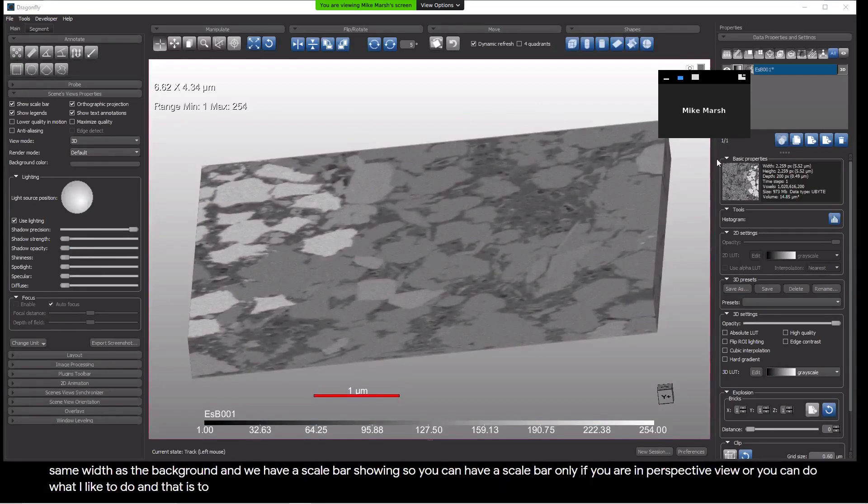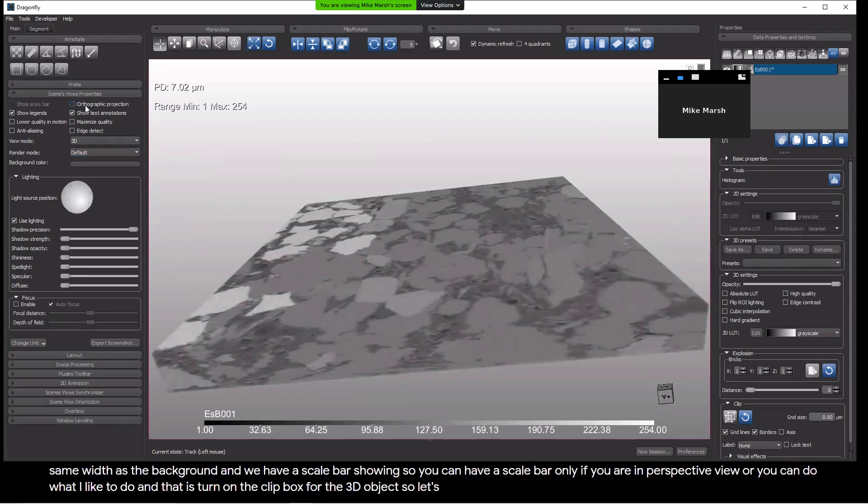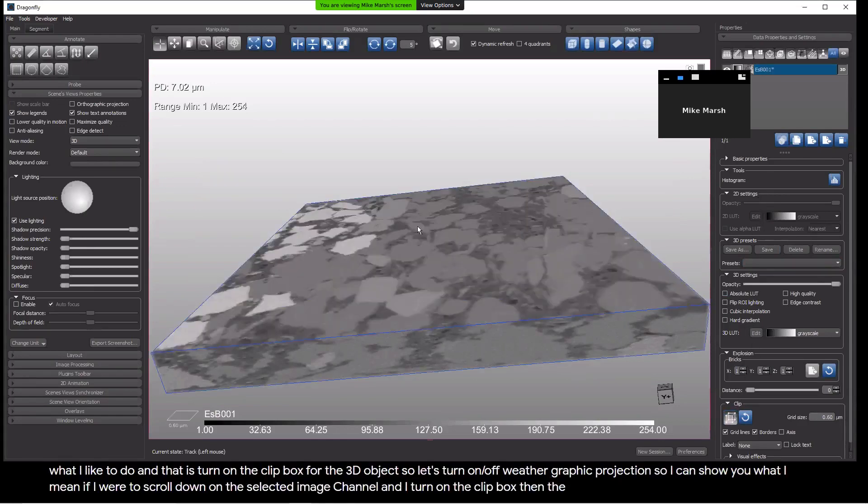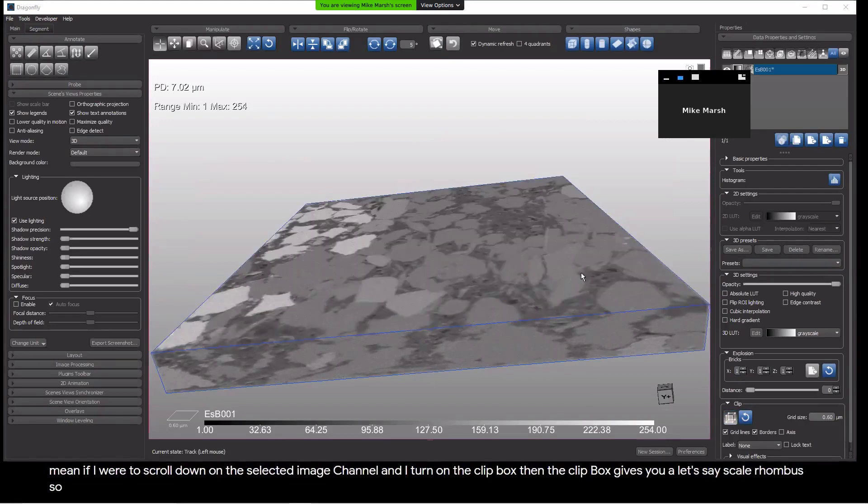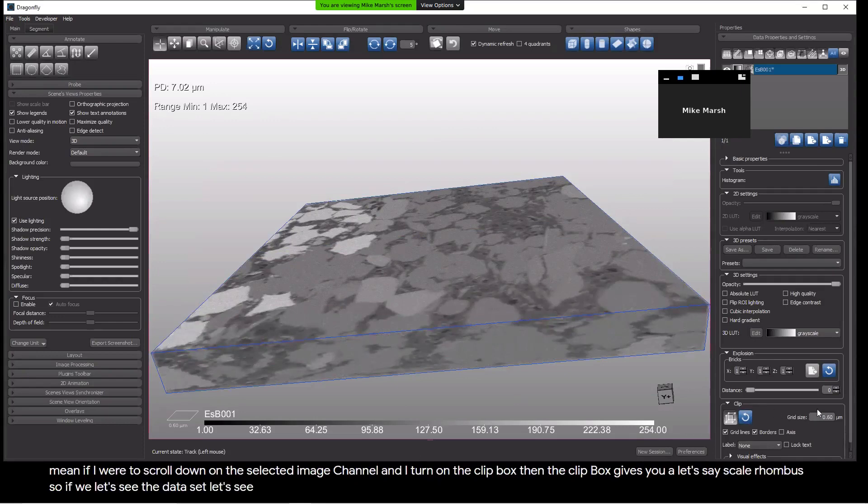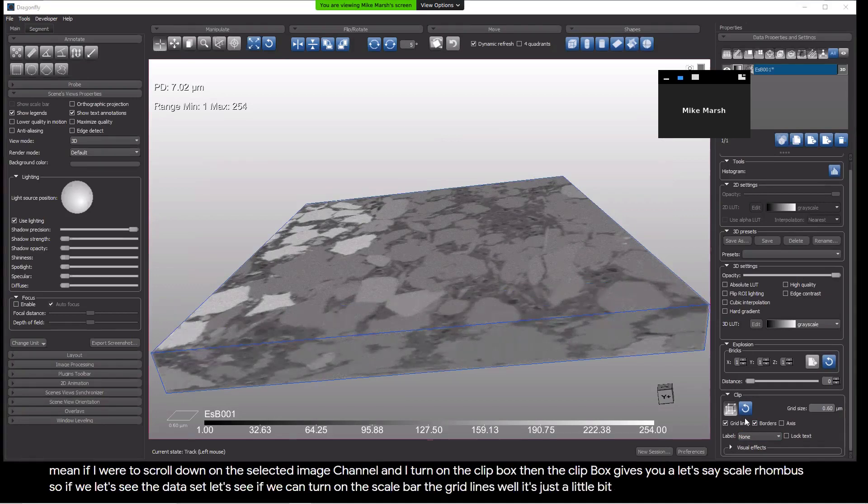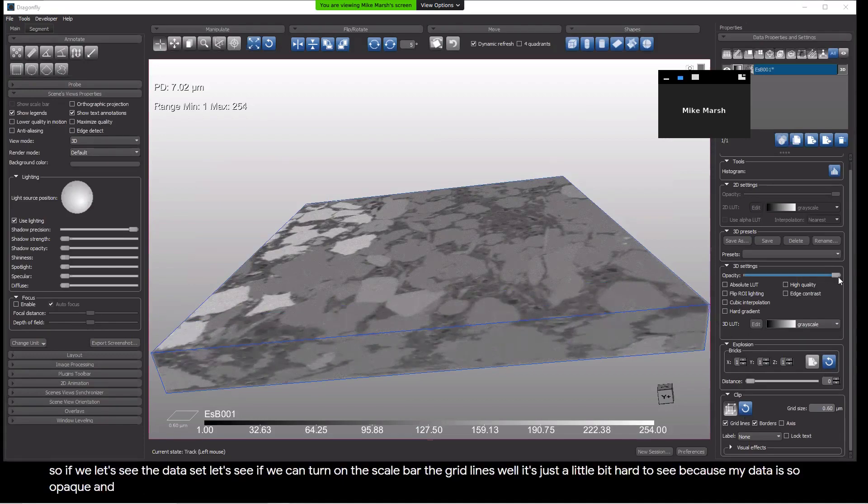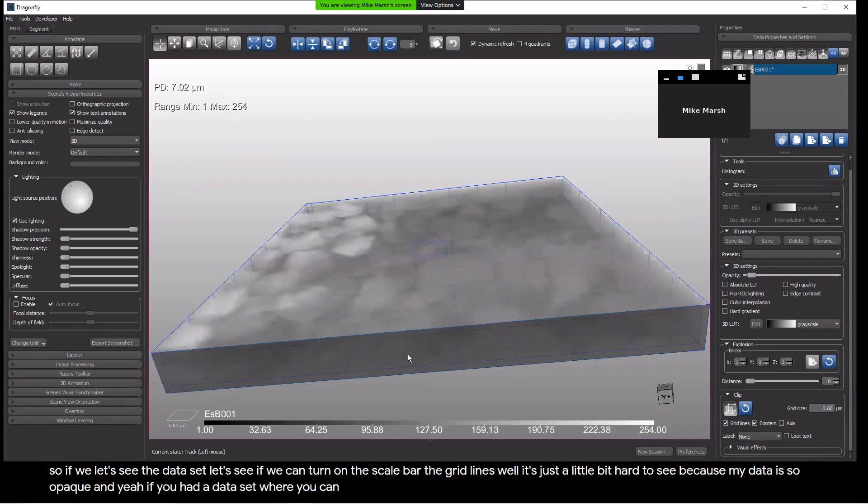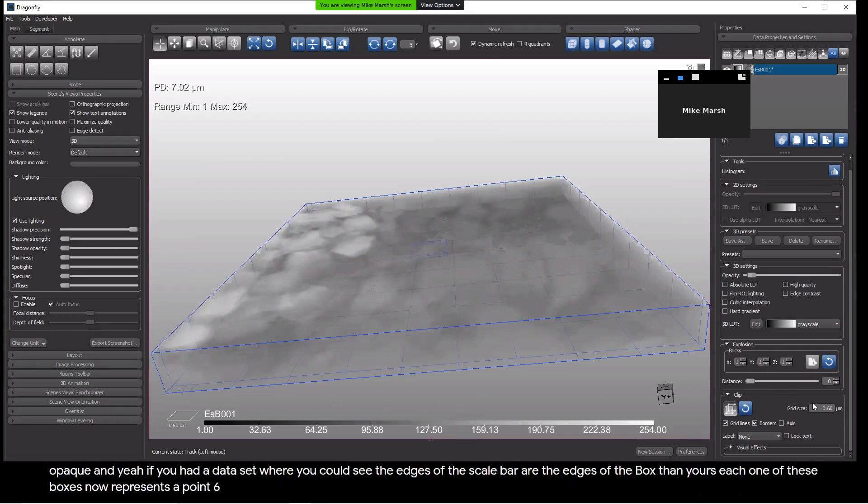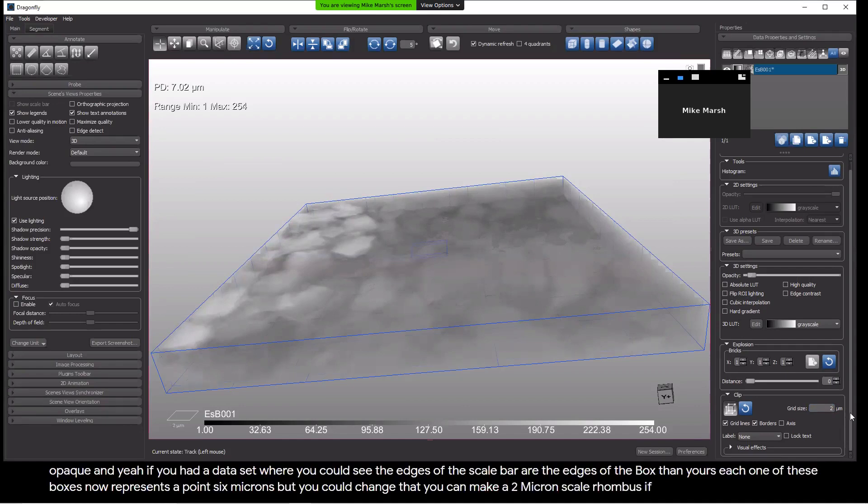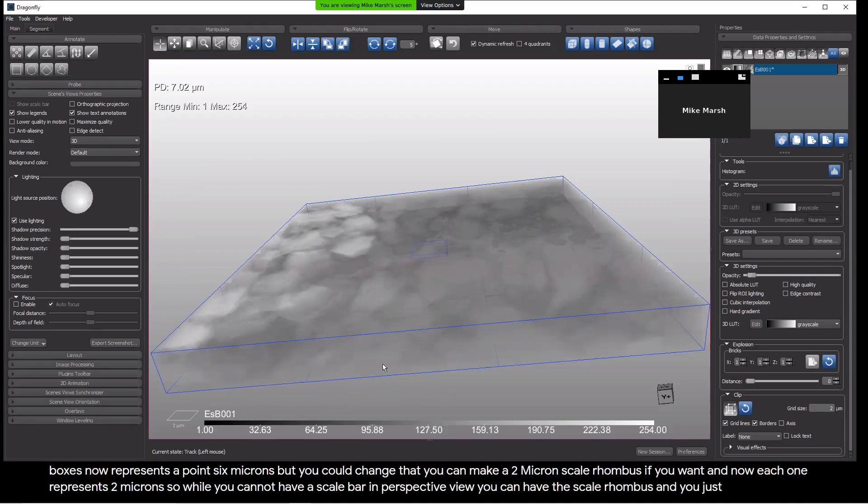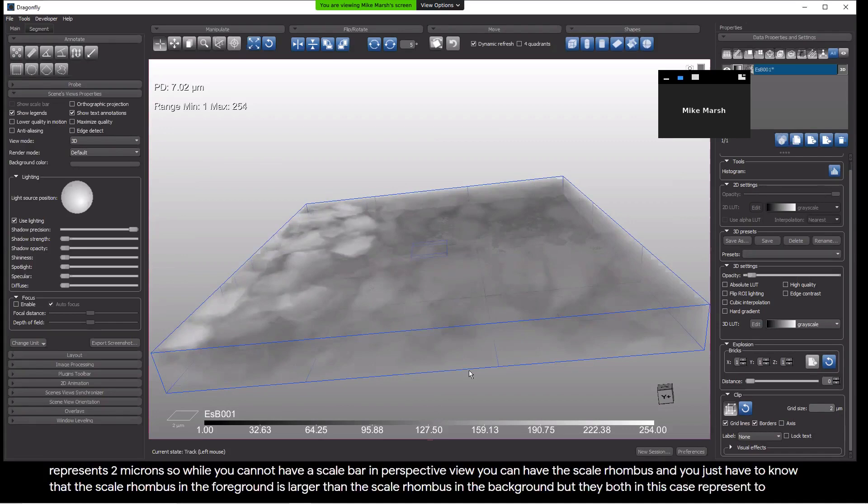You can do what I like to do and that is turn on the clip box for the 3D object. Let's turn off orthographic projection so I can show you what I mean. If I were to scroll down on the selected image channel and I turn on the clip box, then the clip box gives you a scale rhombus. If you had a data set where you could see the edges of the scale bar or the edges of the box, then you'll see each one of these boxes now represents 0.6 microns, but you could change that. You could make a two micron scale rhombus if you want. And now each one represents two microns. So while you cannot have a scale bar in perspective view, you can have the scale rhombus and you just have to know that the scale rhombus in the foreground is larger than the scale rhombus in the background, but they both in this case represent two microns.